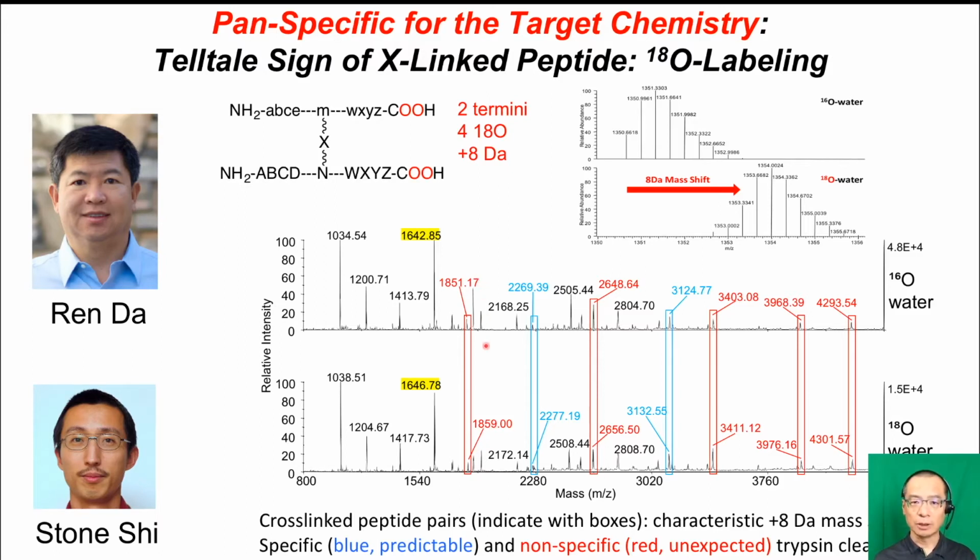The bottom trace shows that all these peaks are detected by isotope labeling, but some of the peaks would be missed if we only used the typical criteria to look at cross-linking events, because some of them are miscleaved peptides.